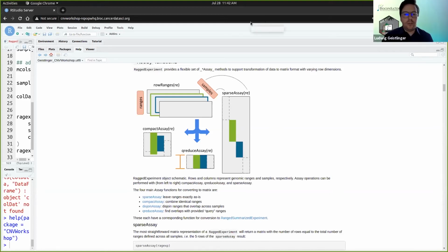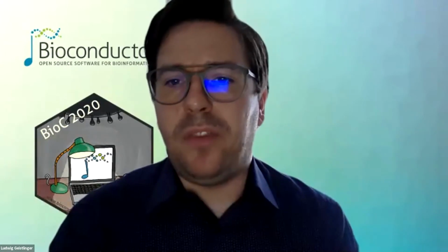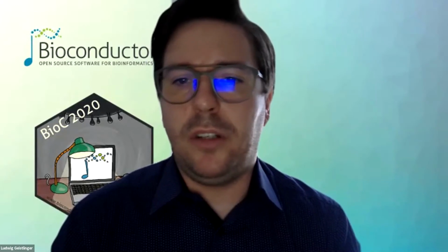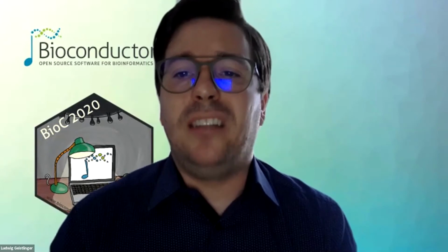Another question which seems to be for me is, if I got this right, about the CNVRanger approach. This summarization approach is useful for downstream analysis once you have already identified CNVs. Are there Bioconductor packages for CNV de novo discovery? Well, there's a lot of things to say here.